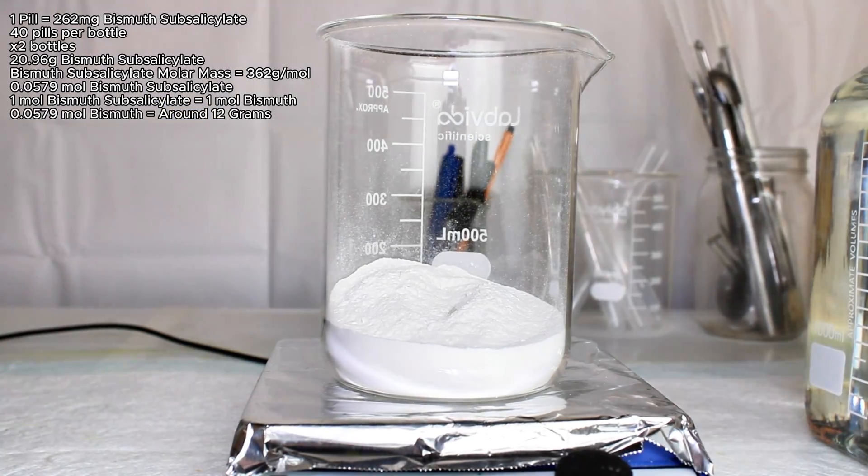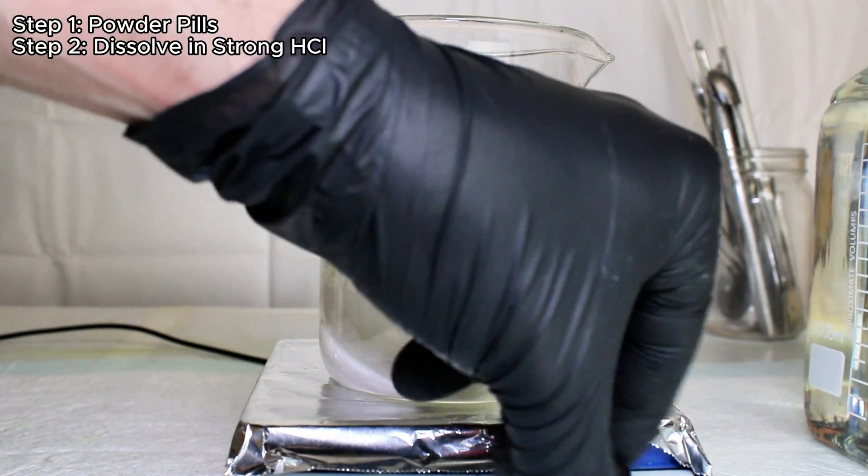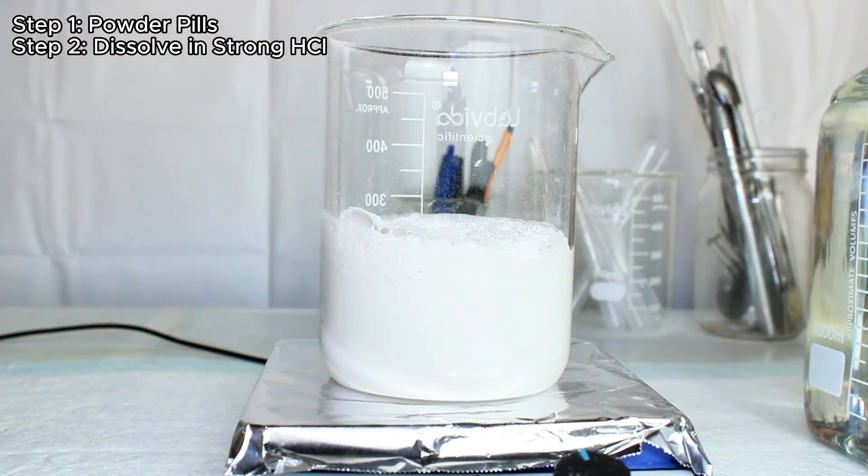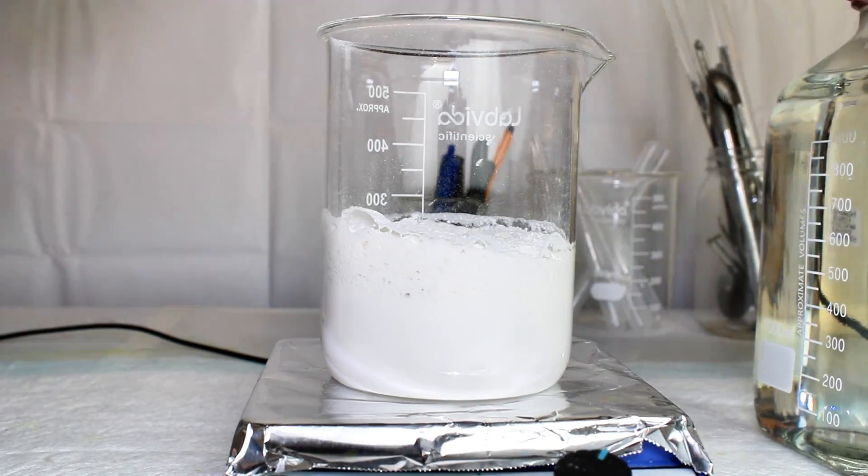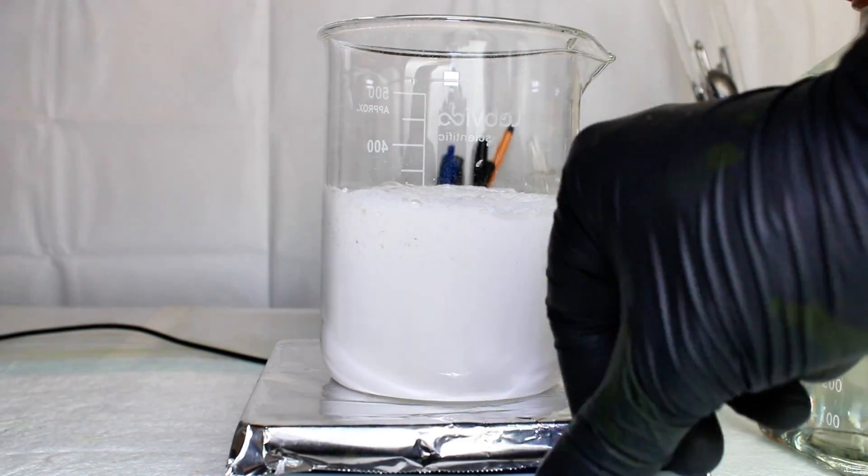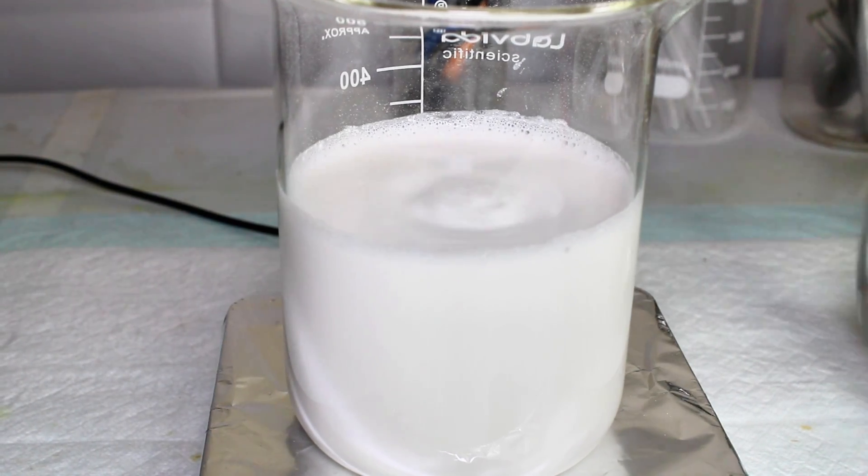To do this, I first needed to powder the pills and soak them in 400 mL of warm hydrochloric acid. I used a 12 molar solution here diluted down to 4 molar to be safe, but you could probably get away with using an even lower concentration. The role of the hydrochloric acid here is to dissolve the bismuth subsalicylate, forming salicylic acid and soluble bismuth chloride.